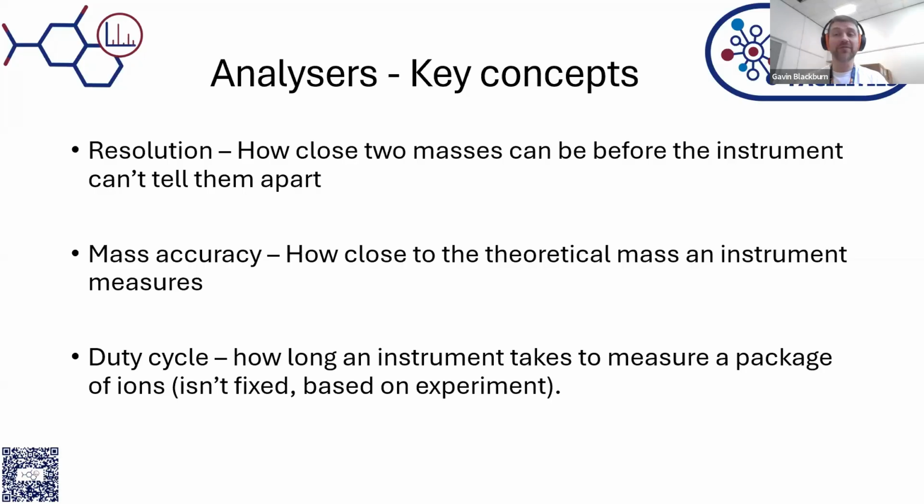There are three really, really well-known mass spectrometry designs that give you really high resolution. That is the ICR, or the ion cyclotron resonance instruments, which will give you the best resolution you can possibly get. There's time of flight instrumentation, and there's Orbitraps. And I've mentioned that we use time of flights and Orbitraps within my lab. Why do we do that?